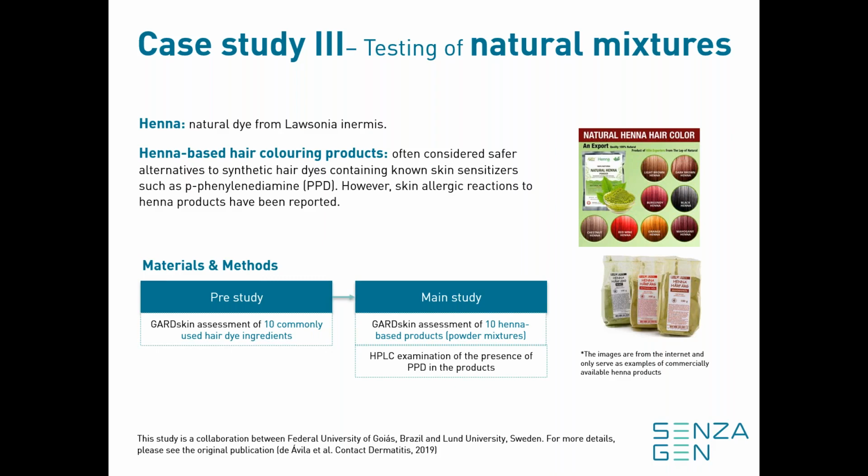So this project was essentially divided into 2 parts. First of all, a pre-study was performed where a total of 10 hair dye ingredients were tested in the GARD assay and also in other in vitro assays. And in the main study, the GARD skin assay was used to assess the sensitizing properties of 10 complex samples based on henna products, which were actually off-the-shelf and commercially available products.